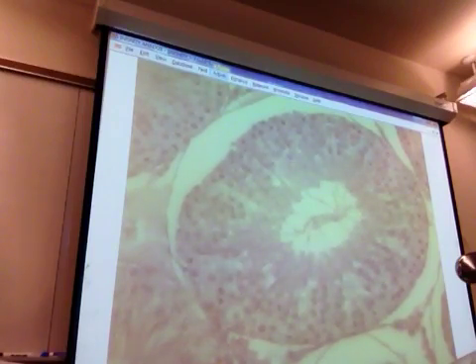Is that a primary? That's a primary. So where are the spermatogonium? The spermatogonia would be something like, I'm trying to find a good cut, like this one. Notice it's right next to the nurse cell, and it's the very most bottom that you can get. So this would be the spermatogonia, but you notice how the chromatin's different looking in the nucleus between here and here? That would be the spermatogonia, like this guy and this guy, but then this guy would be a primary, and then you go up.